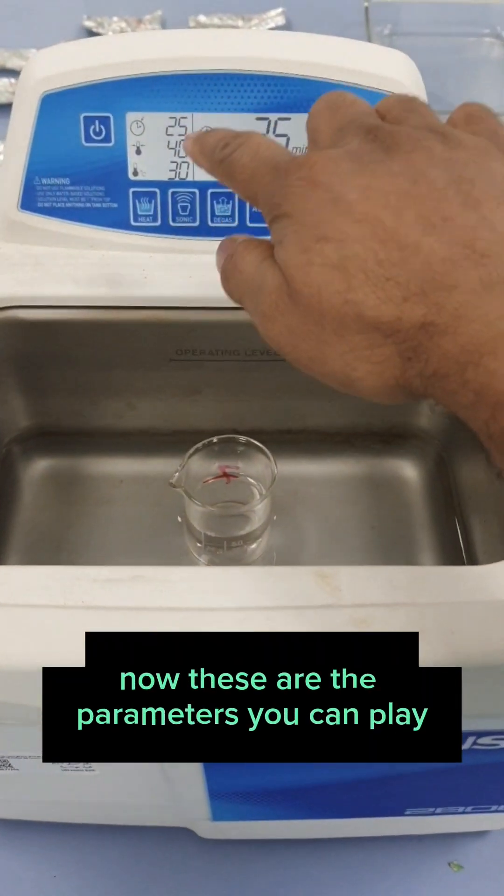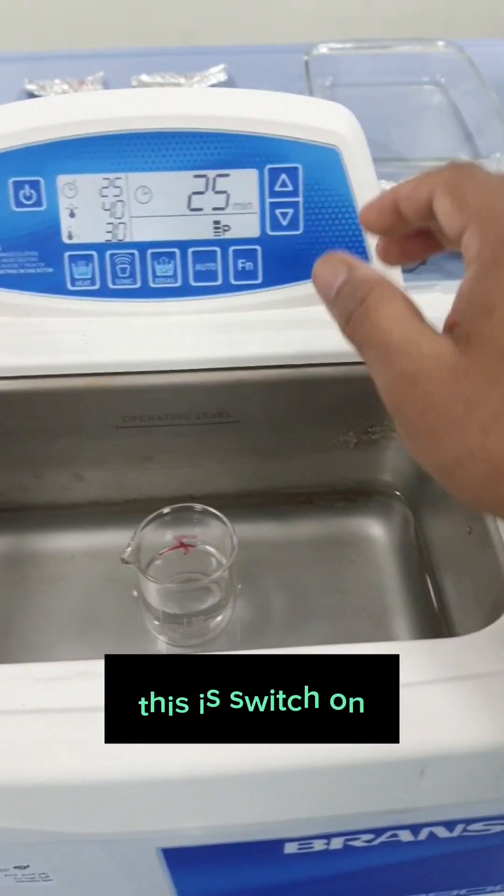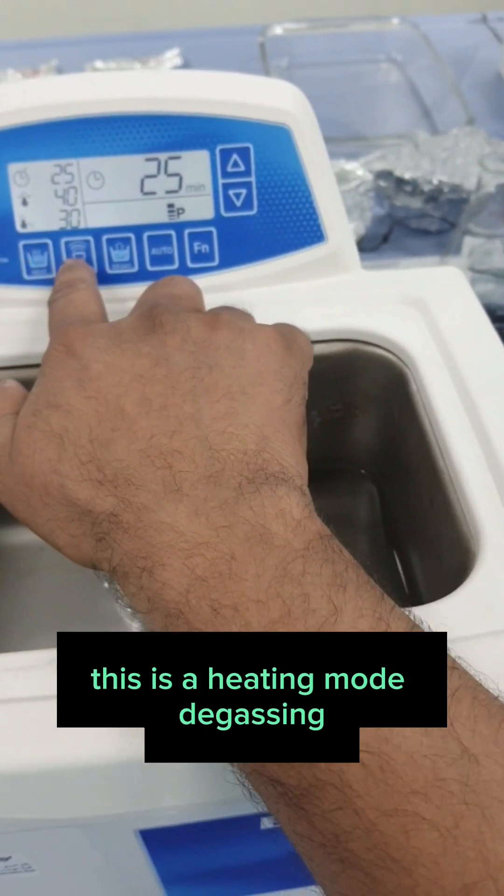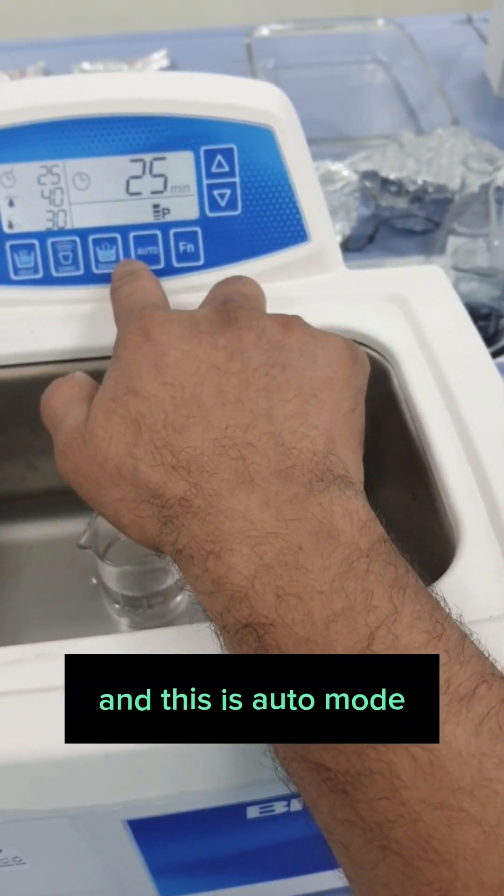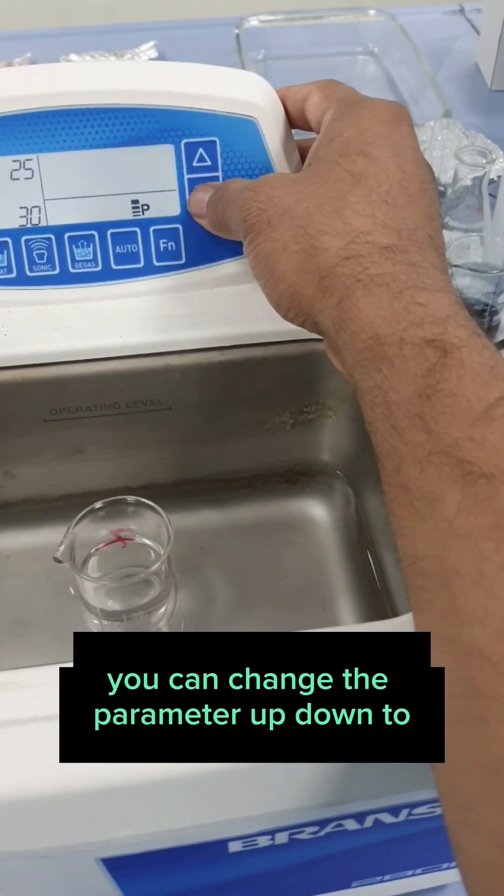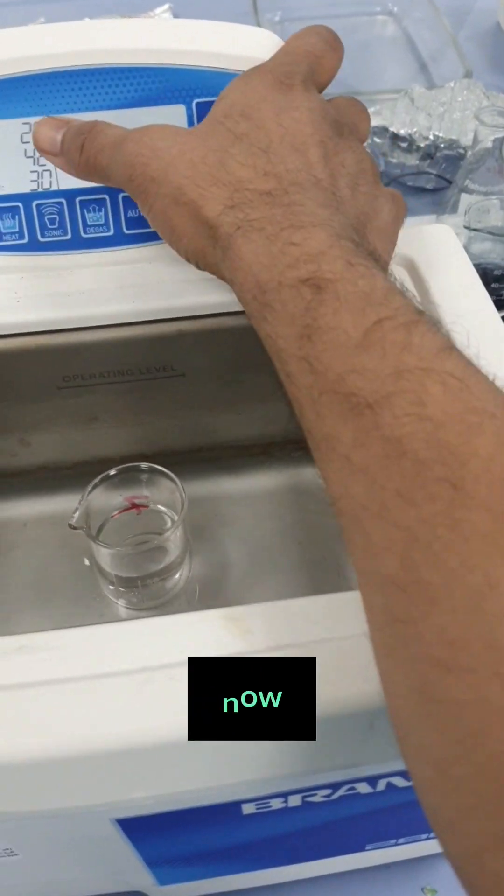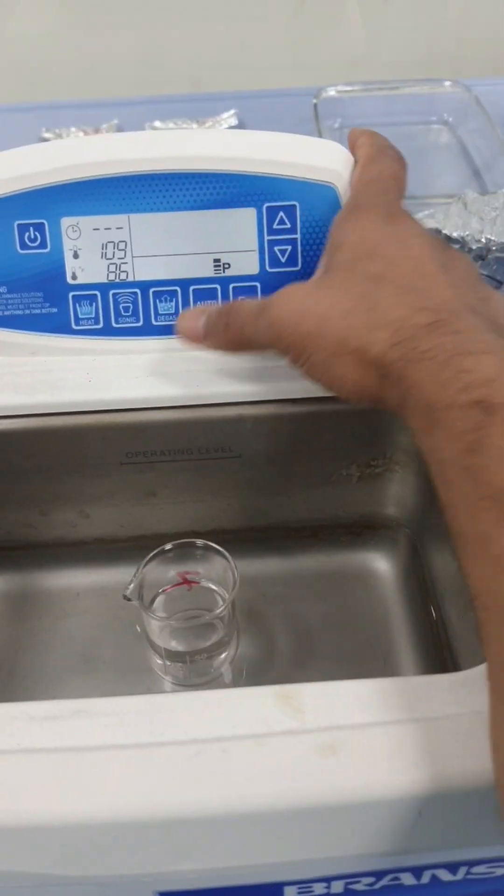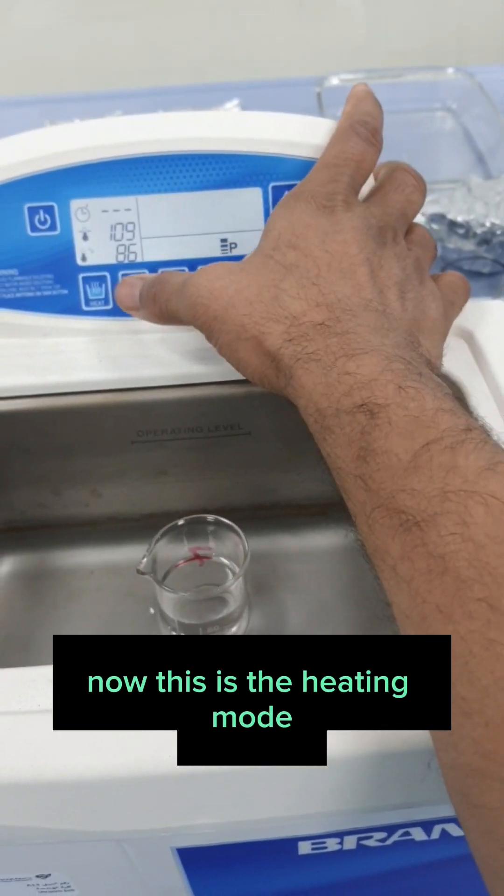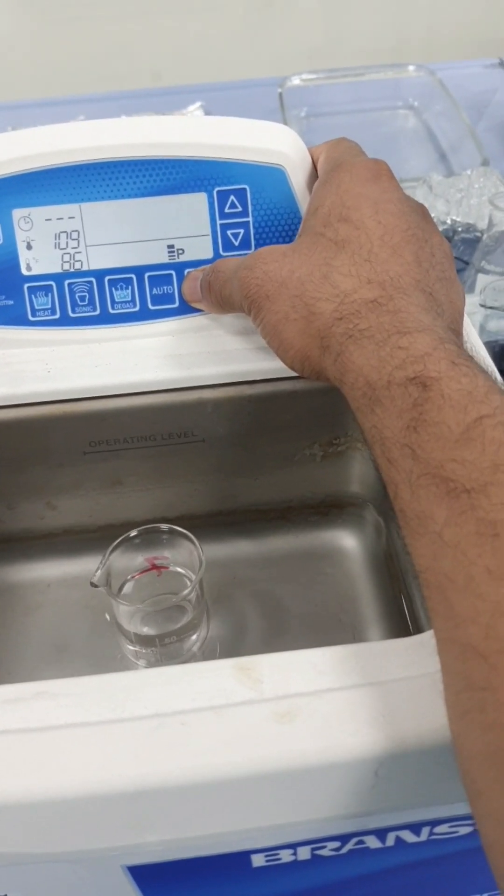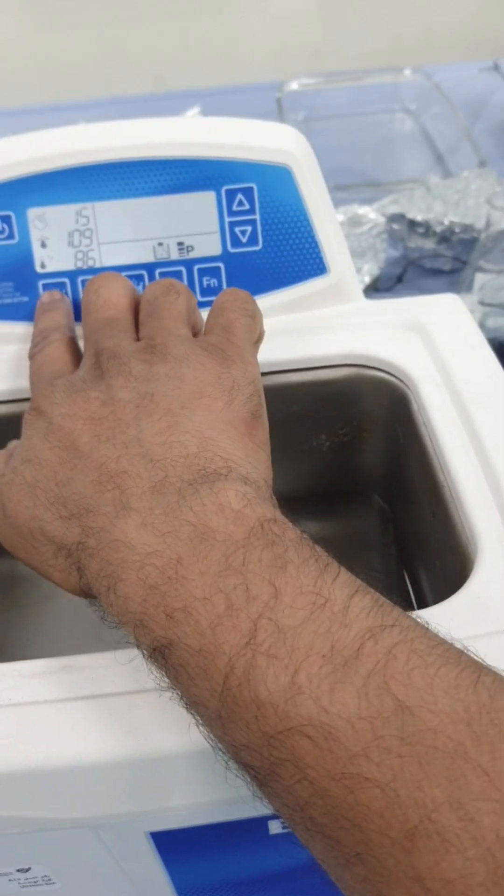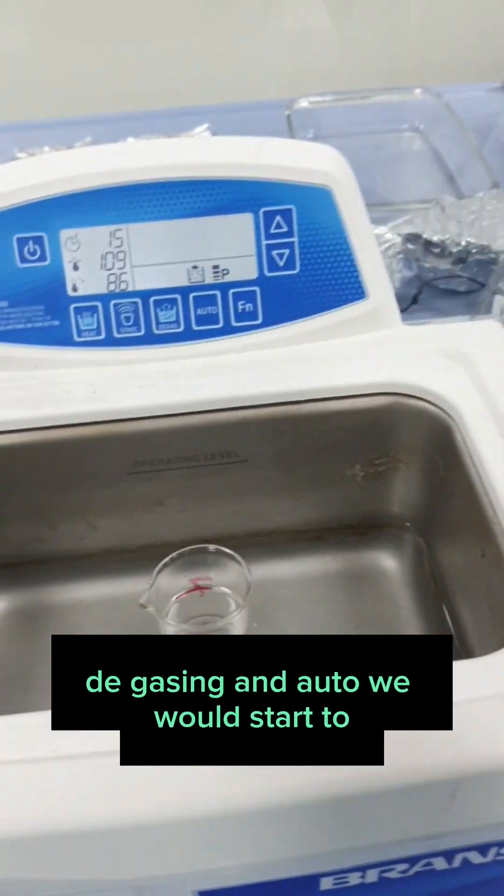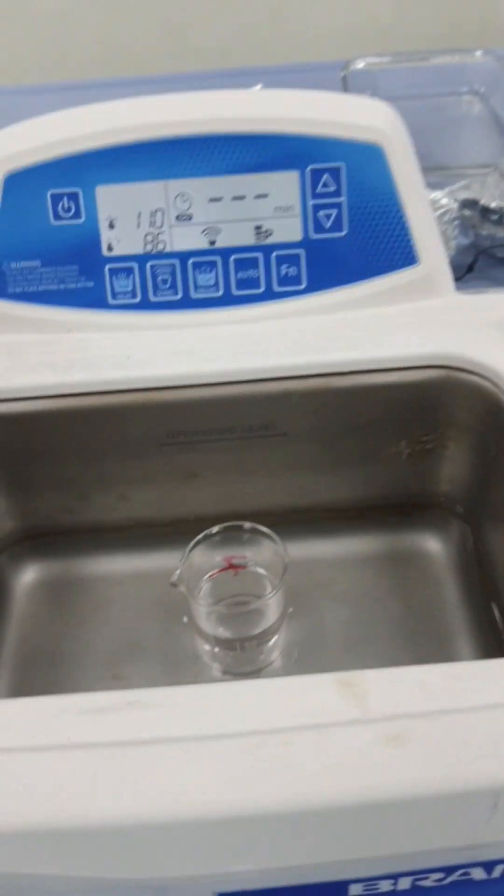These are the parameters you can play with. Here you have switch on, switch off. This is the switch on. This is the heating mode. Degas. Sonic. Degas. This is auto mode. And this is functions. You can change the parameter up, down. How many minutes you want. This is the heating mode. I will start heating. Degassing and auto. We would start to switch.